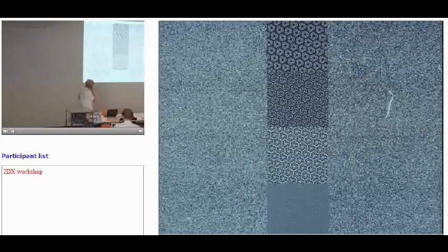This is a slide I made as a tutorial for what we do when we do image processing. This is the raw image. These are all on the same scale. Well, I'll explain it. This is the raw image. After you've indexed it, unbent it, and so on, filtered it, that is the signal on the bottom on the same scale as the raw image. So you can see that the signal from the 2D crystals, if it's a thin crystal that's a membrane protein and so on, isn't very high. It's about 10 times less than the noise.